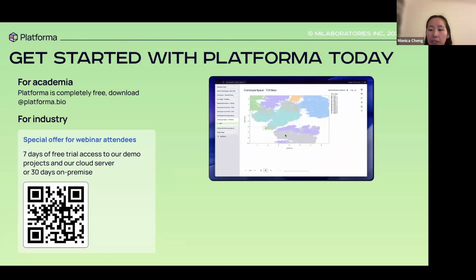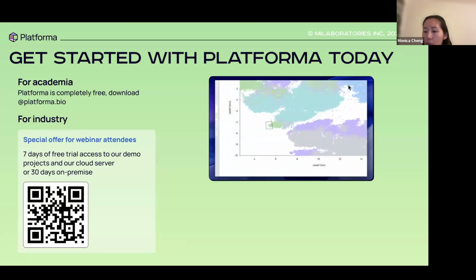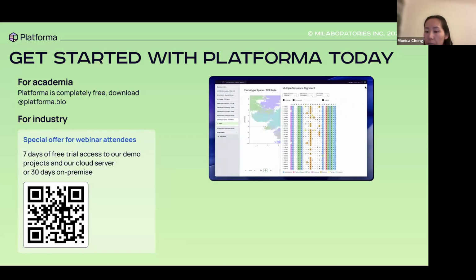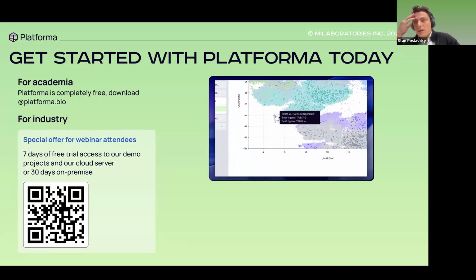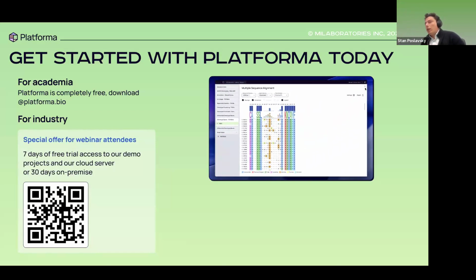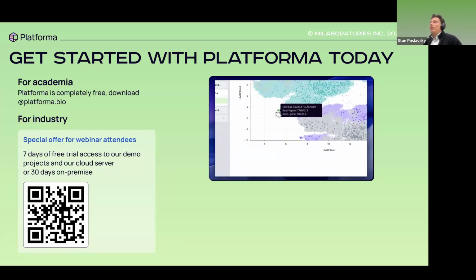So now we're going to move over to the Q&A. We have a question from David: Do you find that you need to do parallel phage display selections to increase the significance of your enriched clone ranking? Yeah, it's a very good question. There are two answers. One answer, yes, it will increase statistical significance.